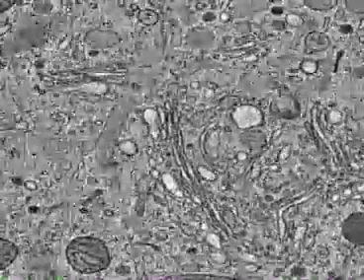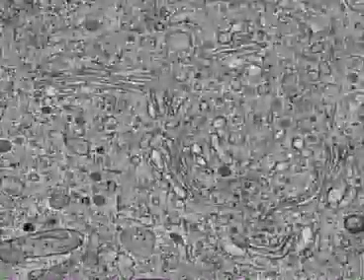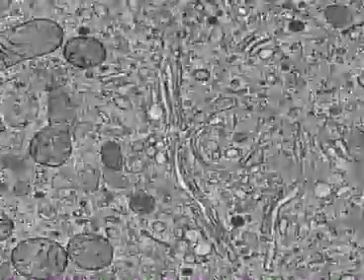High-voltage electron microscopy allows three-dimensional imaging of a segment of this insulin-secreting pancreatic cell. Relatively thick slices of the cell are viewed in the microscope from different angles, which allows us to reconstruct a three-dimensional image.